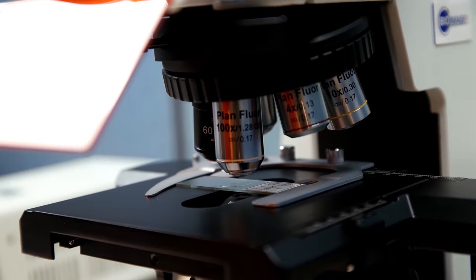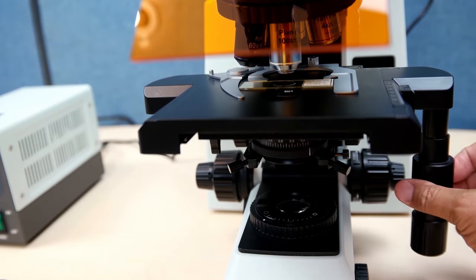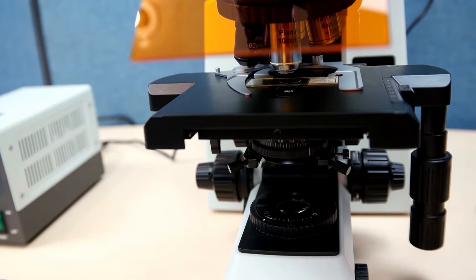The nosepiece in this microscope by default is quintuple, which has 5 spots. You can also upgrade it to sextuple or septuple, 6 or 7 spots. It has a double layer mechanical XY stage and its precision in movement is 100 microns.